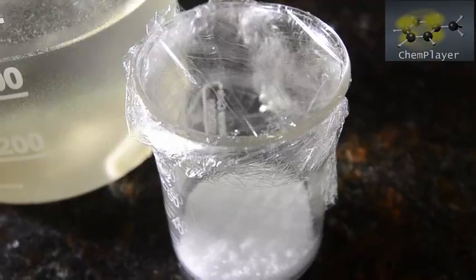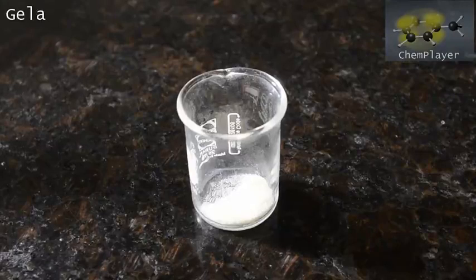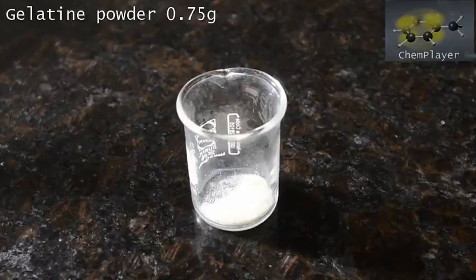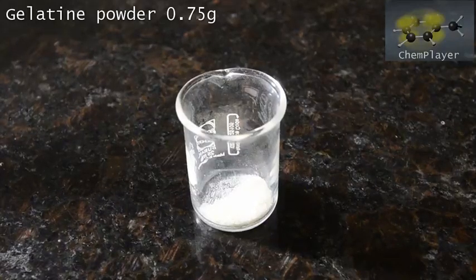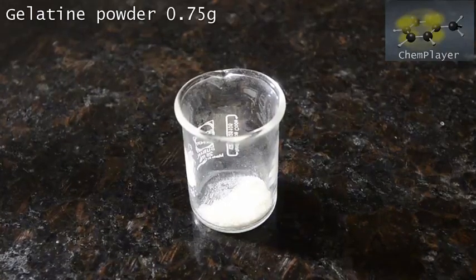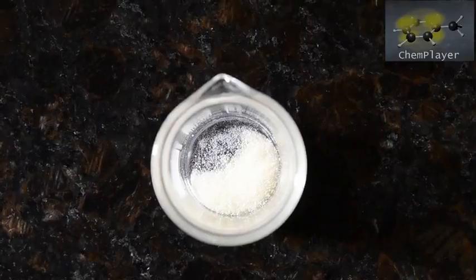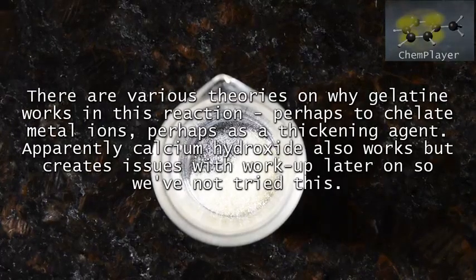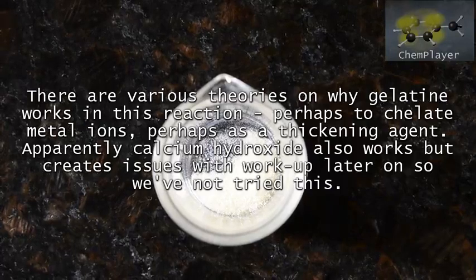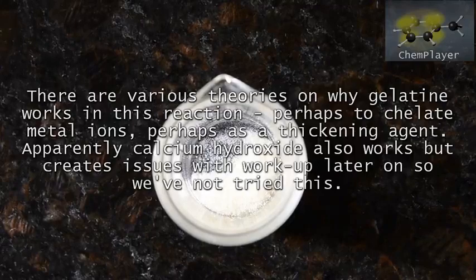While we're waiting for this to cool down we can prepare our other reagents. We've weighed out 0.75 grams of powdered gelatin. This is regular baking grade gelatin, the same gelatin we use in cake recipes. Exactly what it does is not completely known, but it's thought to chelate any tiny amounts of metal ions such as iron which might exist in the reagents. Metal ions catalyze the decomposition of the hydrazine, so this helps to prevent it. Apparently using calcium hydroxide also works, but we've not tried it.